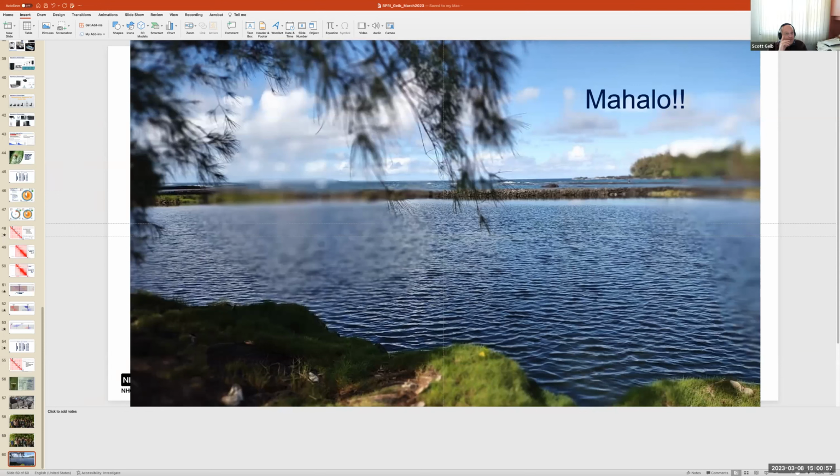Yeah. And even Hi-C or something can validate that in the same way the long reads could, right? Or even the short read. When I say short reads, I mean Illumina Hi-C. Yeah, that's exactly what I mean.